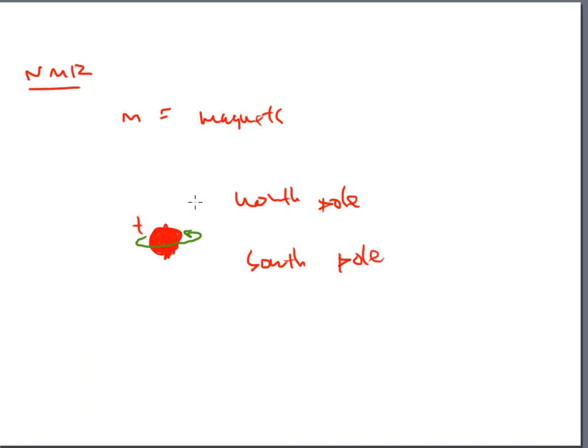So these planets will spin. They have a rotation to them. This is how we get night and day. And atomic nuclei are really not any different. Atomic nuclei, think of them as kind of ballish in figure, and they have a spin that's associated with them, or maybe a rotation.